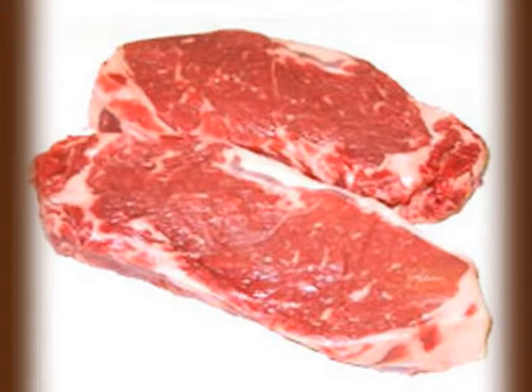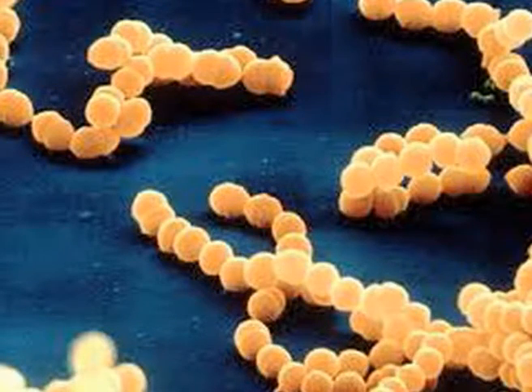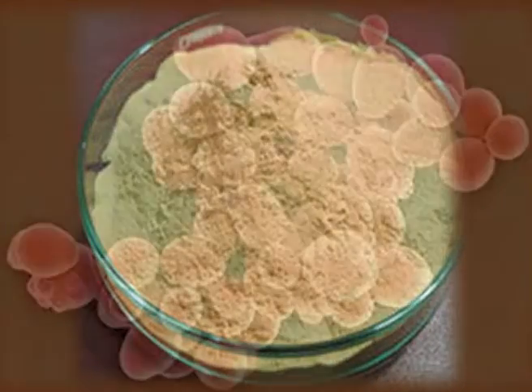Why is it so? The complex media means they contain digests or extracts from animal and plant tissues which are undefined in composition. And they break down these complex medium ingredients to their carbohydrate, protein, etc. Like the beef extract which we add to the medium for the cultivation of heterotrophs generally serves as a source of organic carbon to them. Plus the peptone which we add to the culture medium serves as a source of nitrogen, energy or sometimes organic carbon. Similarly, the yeast extract, which is derived from the yeast cell, serves as a rich source of vitamin B. So that is the reason why heterotrophs are generally grown in complex medium.